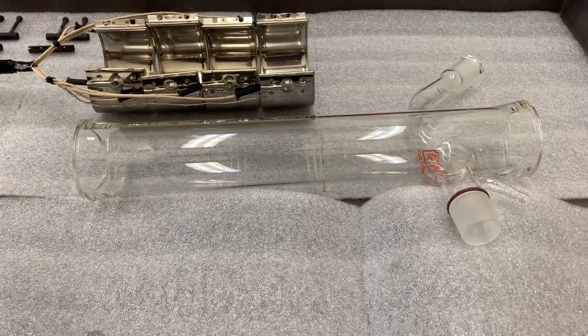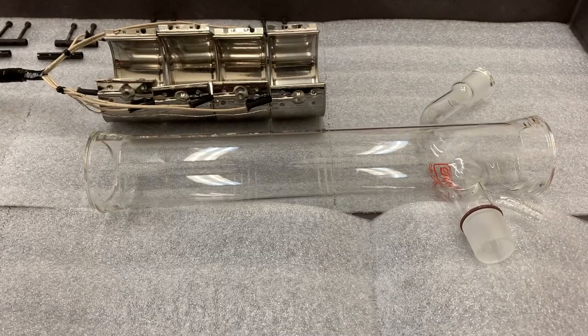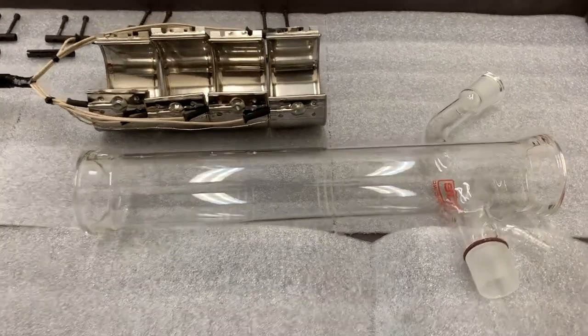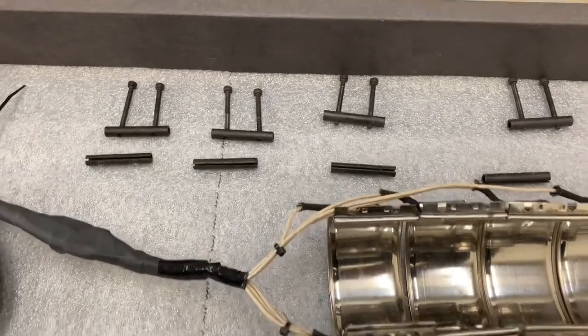Now that the metal band heaters have been removed and the glassware is cleaned, fixed, or whatever else needed to be done, we're going to reinstall them. We've got our glass body here, the band heaters, and all the connectors for the band heaters ready to go.